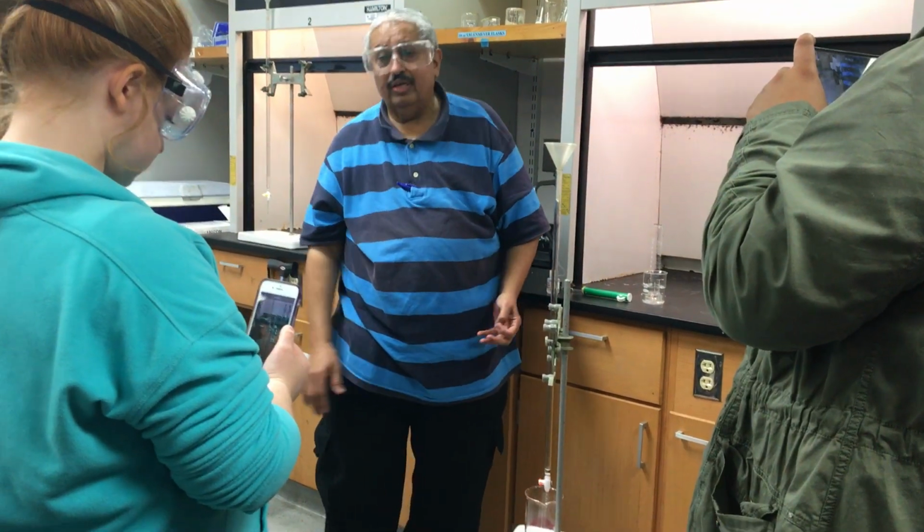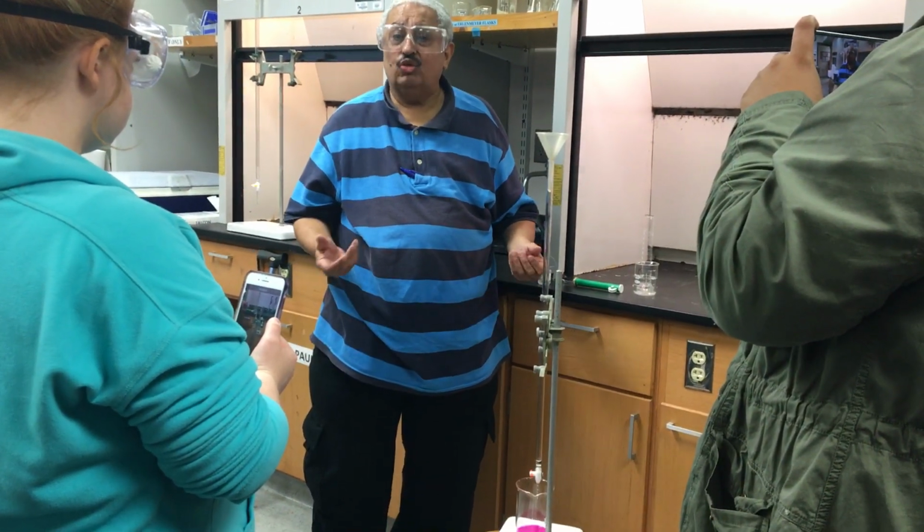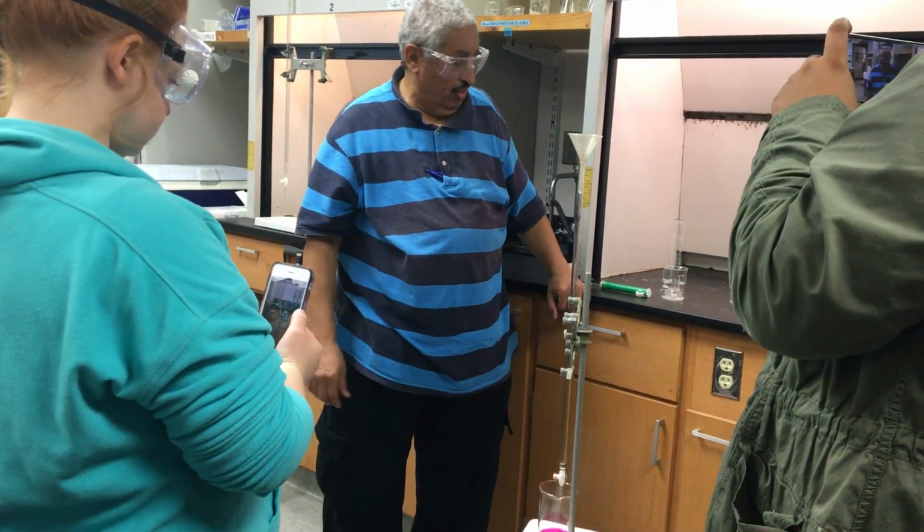If there is an accident, just let me know because it's soapy and very slippery. Sodium hydroxide on the floor is very dangerous because it's like a soap. It's very soapy, so it's very dangerous. So just let me know.